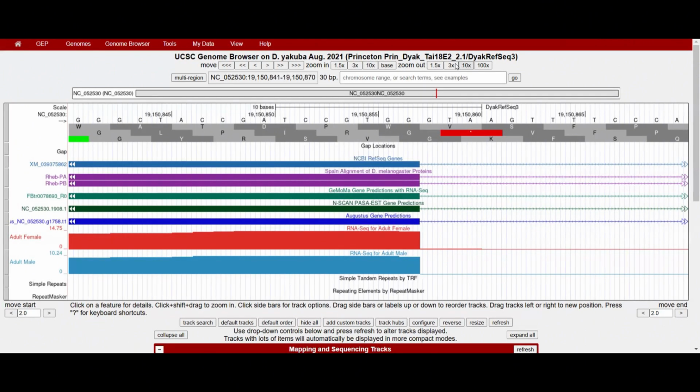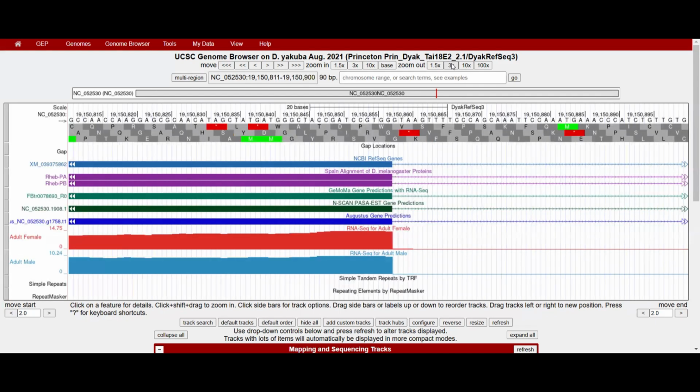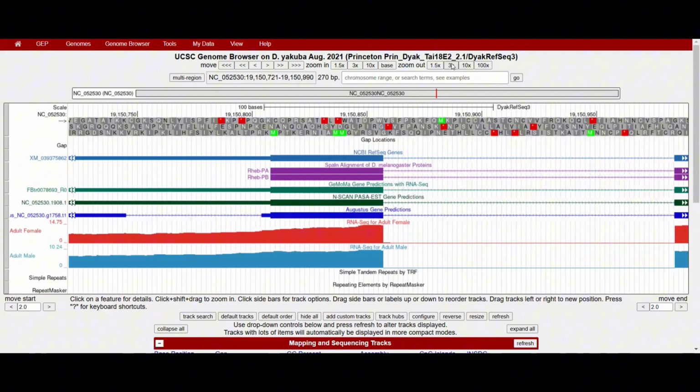Now, let's zoom out far enough to see the entire length of CDS1 and confirm which reading frame we are in. We can see here that reading frame 1 has stop codons in it. However, reading frame +3 has an open reading frame, meaning that there are no stop codons, and it also has the start codon we need at the beginning of our CDS.